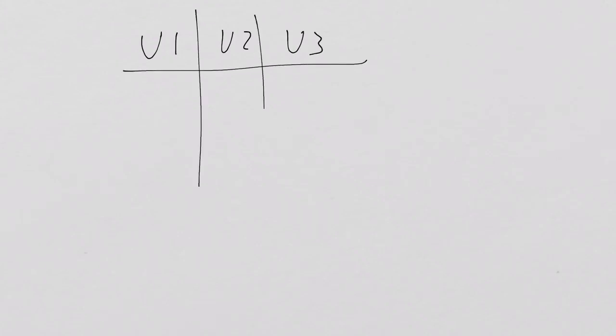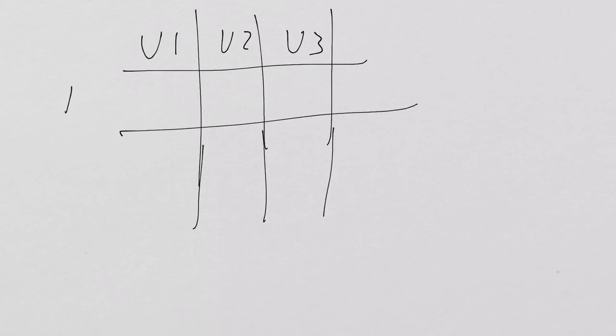Another thing that people asked me was, what is this with this table where I said U1, U2, U3? And I said, ideally, what you want to have is the absorbance here. So you get 3 different absorbances. Ideally, you get only 1 absorbance if you are very good, but you probably get 3 different ones. And then I said, equivalent to BSA.